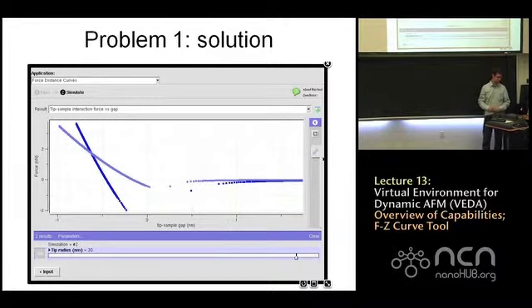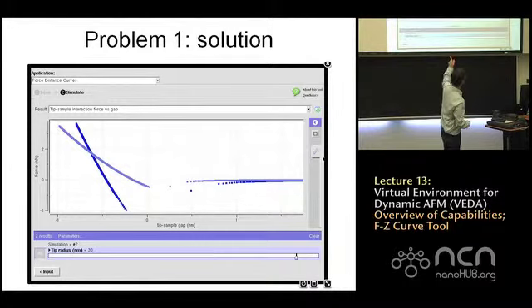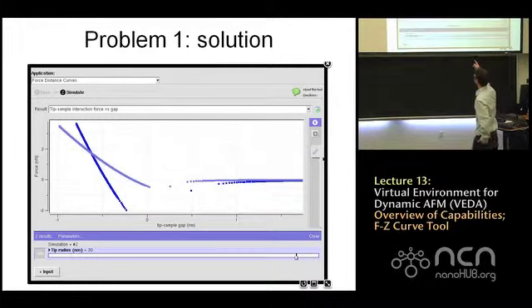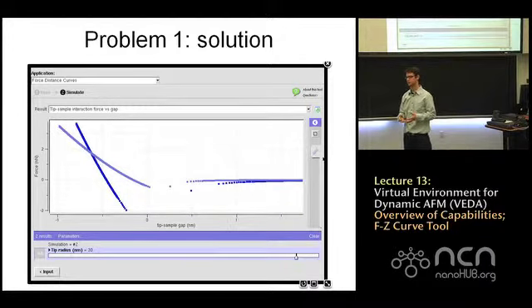So the result is, if you plot both of these curves, and on my computer one of them is light and one of them is dark, but I guess it didn't come out well on the screen. What happens is the shallow low slope line is where the tip is 10 nanometers, and the steeper curve comes from the tip being 30 nanometers. There are two effects here. One is that the adhesion force goes up for the tip being 30 nanometers because now the van der Waals forces are acting on a larger tip radius.